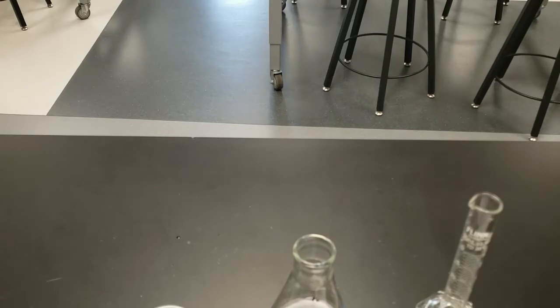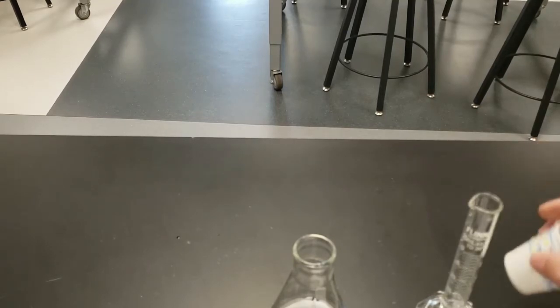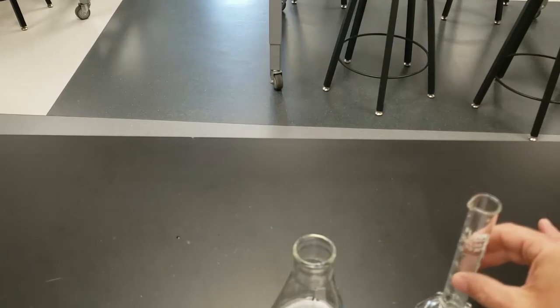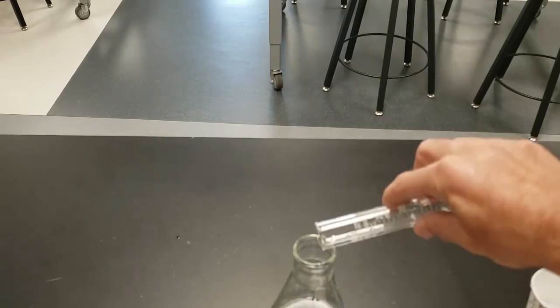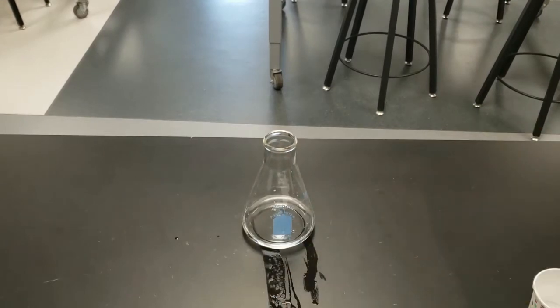So to get the other 5 milliliters, I'm just gonna do the same thing. I'm gonna pour in some, and I hit it right on the mark that time. So now I've got 30 milliliters of water in my Erlenmeyer flask.